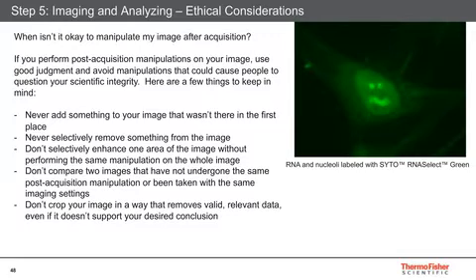And don't crop your image in a way that removes valid, relevant data, even if it doesn't support your desired conclusion. I think we all who have experience have known someone who has broken some of these rules, and it's important to call them out on it. And if you do make any changes, it's a good idea to mention it in the captions of your paper.